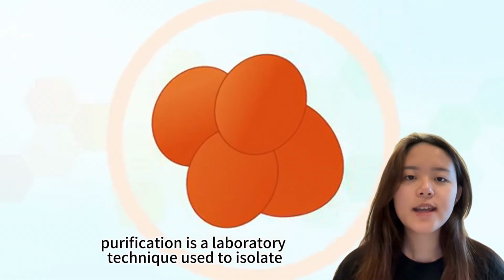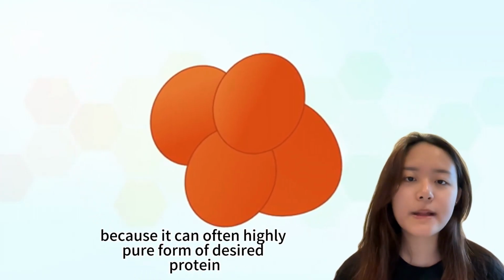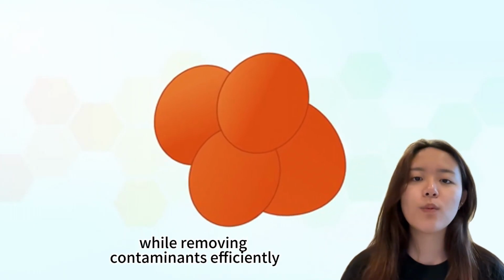Protein purification is a laboratory technique used to isolate a target protein in a complex mixture. Scientists use this technique to study protein function and structure, drug production, and industrial application because it can obtain a highly pure form of the desired protein while removing contaminants efficiently.